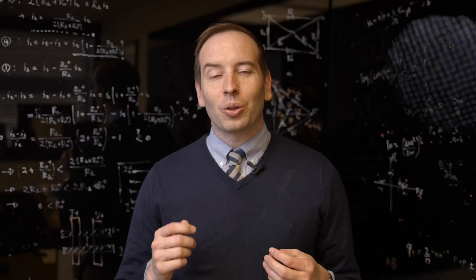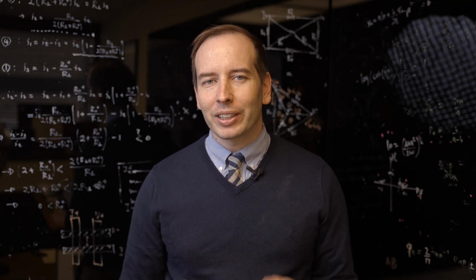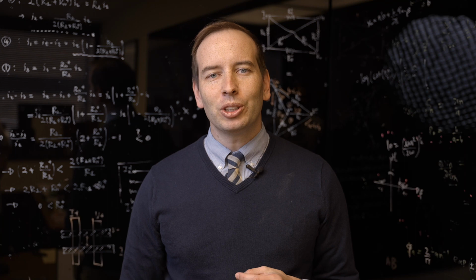To illustrate the incredible resolving power of modern electron microscopes, the microscopes we have here at the University of Michigan, let me show you a picture of atoms. These are tantalum atoms, at least the bright ones are. There's also some sulfur atoms in there too.